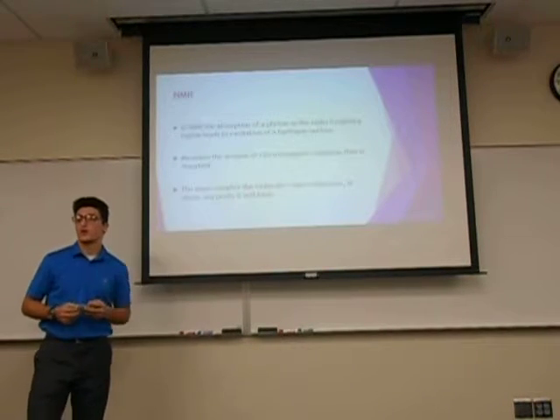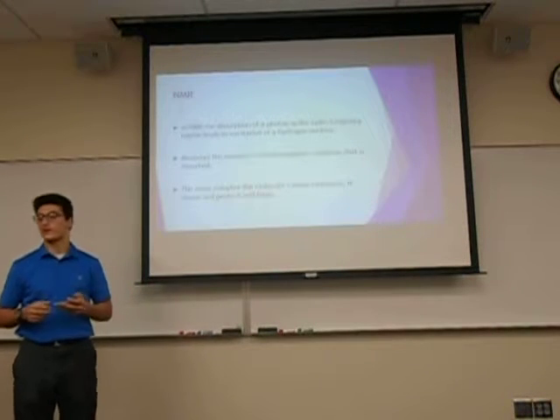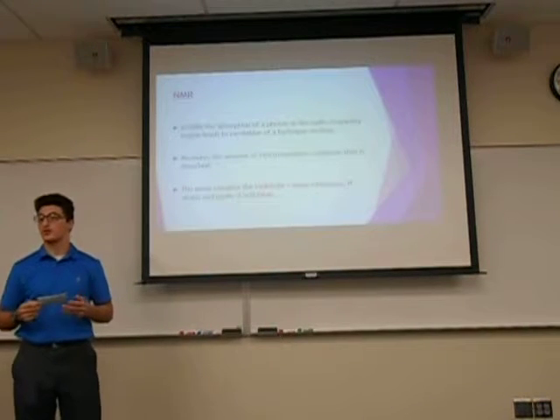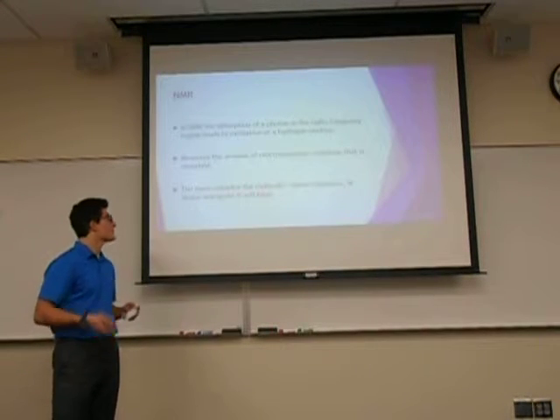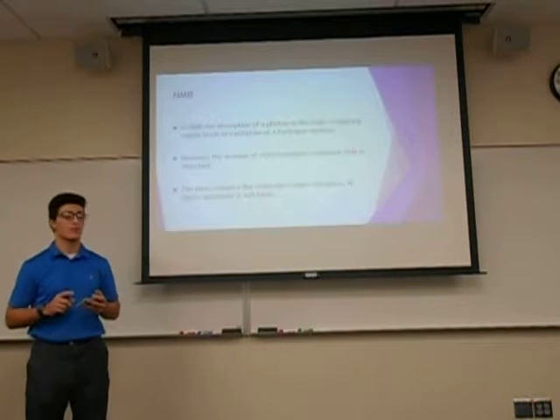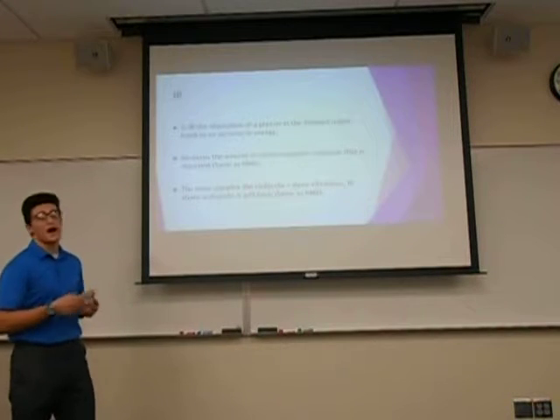Alright, NMR. So what is NMR? NMR is the absorption of a radio frequency region, which leads to the excitation of a hydrogen nucleus. Also, it measures the electromagnetic radiation that is absorbed. And lastly, the more complex the molecule, the more vibrations it'll have, the more hydrogen atoms, and the more peaks it'll have.